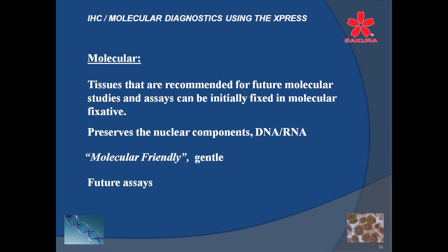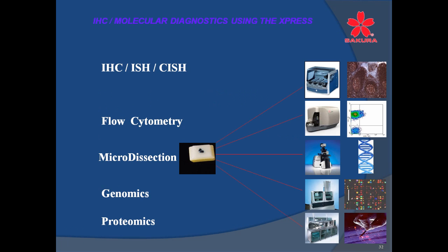So what better people are we than to continue this in finding fixatives to utilize and validate in histology so that we can do things like IHC, FISH, or ISH, in situ hybridization, and the list could go on. We are really the people to do that, not someone down the hall. And if we can find ways to fix tissues in these fixatives that are molecular friendly, then we're going to be the ones involved in this work, which I think is going to be a tremendous asset for all of us in the future.